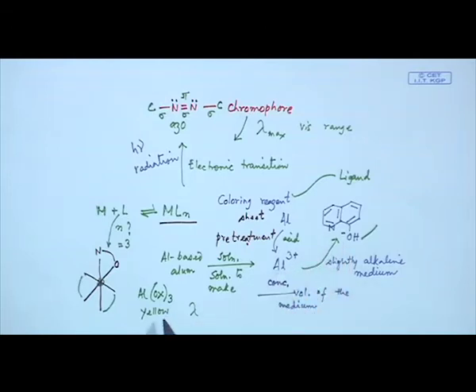So, by the addition of this particular reagent, which is oxine, and by knowing the corresponding lambda max value, which we are not considering right now, we will be able to detect the sharp lambda at a particular value where you have maximum absorption, that means the maximum color absorption can take place at this particular wavelength, which we can detect by using a spectrophotometer.